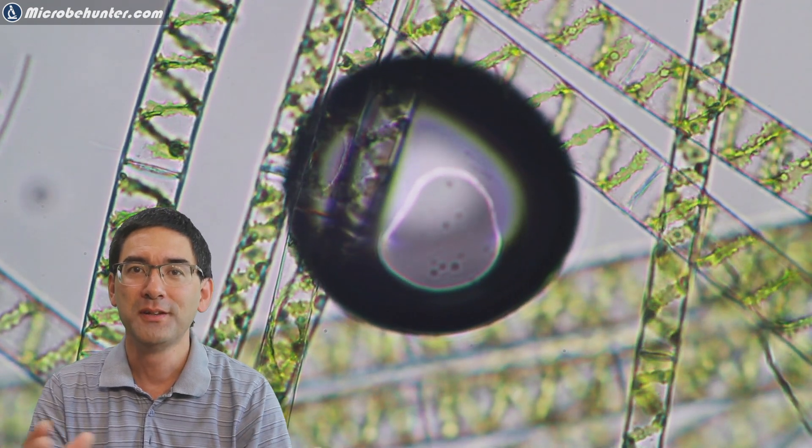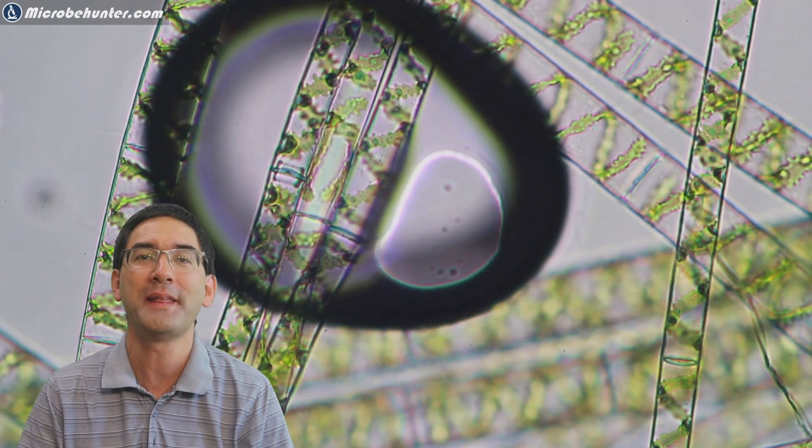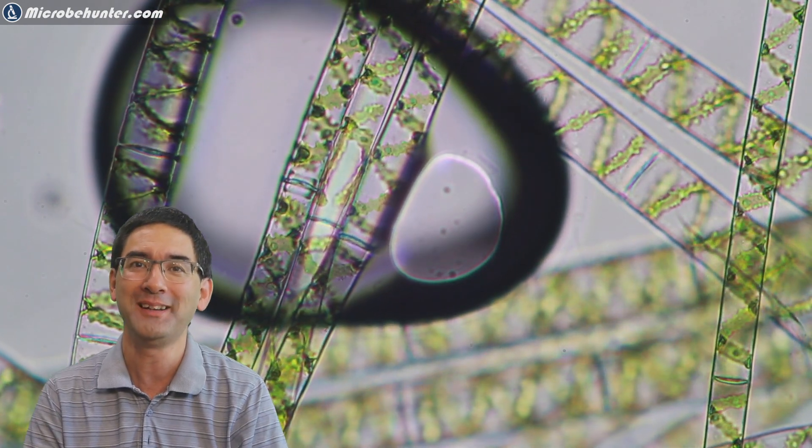Now this bubble that you see here, this expanding bubble, this is an oxygen bubble which is formed by the algae under my microscope slide.